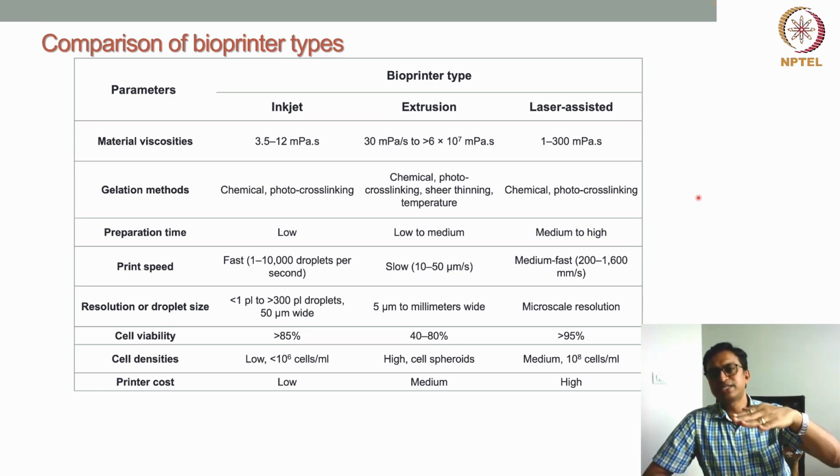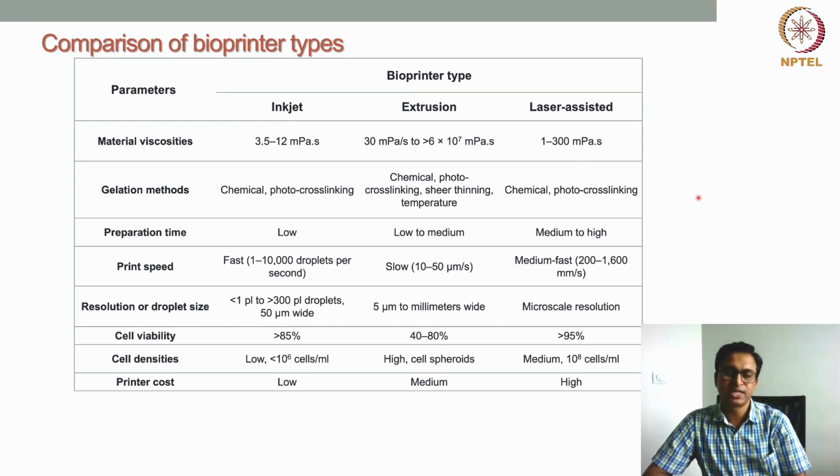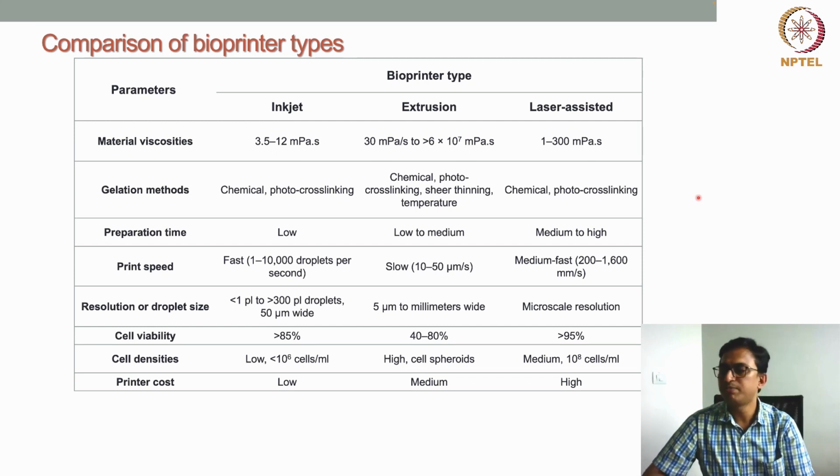The top layer is the glass layer where the laser can pass through, then the energy absorbing metal layer where the laser can strike and heat up, and then the next layer is the bio-ink. When the laser hits the gold metal layer, a bubble will be produced because of the high pressure gas that propels the droplets, right? Or the droplets are dislodged by that high pressure gas.